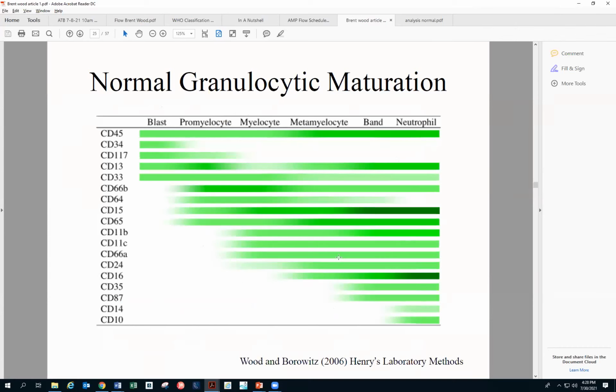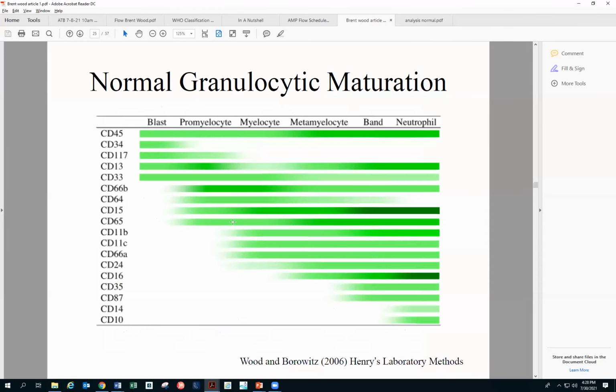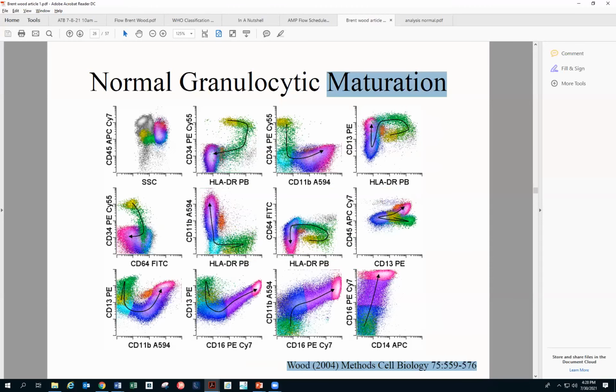Let me show you, let's go through all of this, what we read, to this. Okay, so coming to first things first, 11B. So 11B, we saw, the maturation is going from here to here. Okay, there is someone that needs to mute. Let me. I'll just mute everyone. Rajeshwari, you unmute when you have to speak. Mute all. Okay.